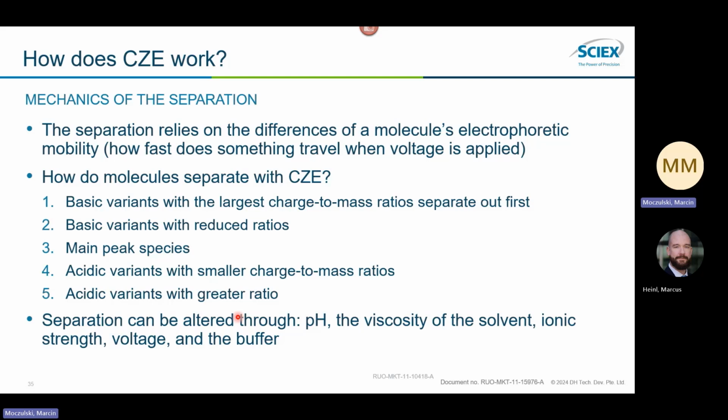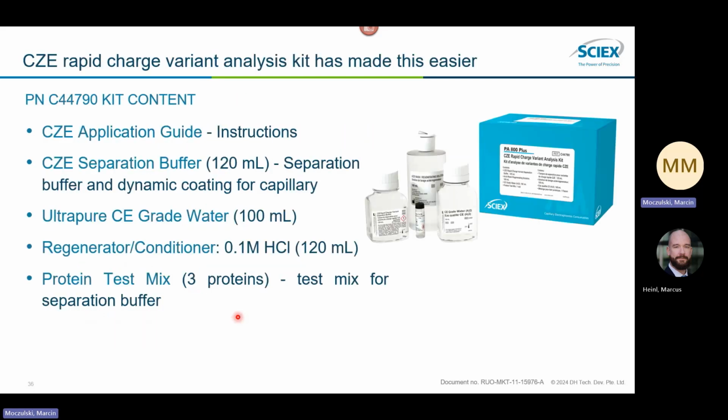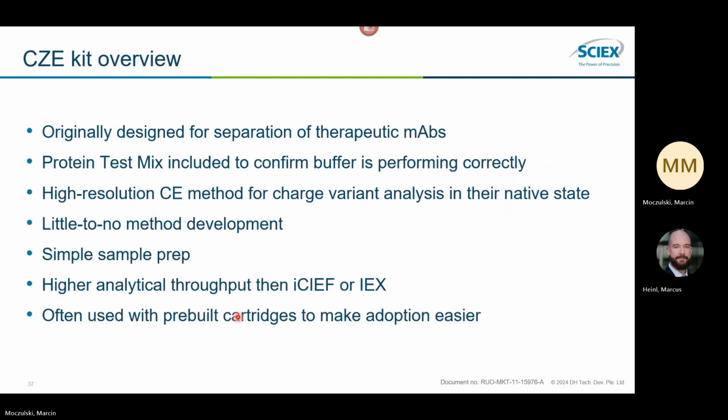The method can be modified by parameters like pH, viscosity of the separation solvent, ionic strength, applied voltage, and finally buffer composition. However, for general biopharma purposes, we started a couple of years ago with a commercial kit designed exactly for charge heterogeneity determination by capillary zone electrophoresis.